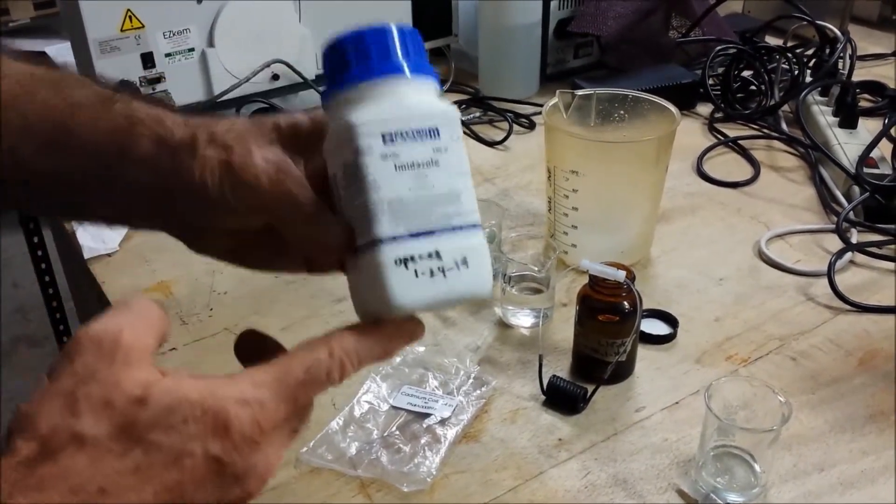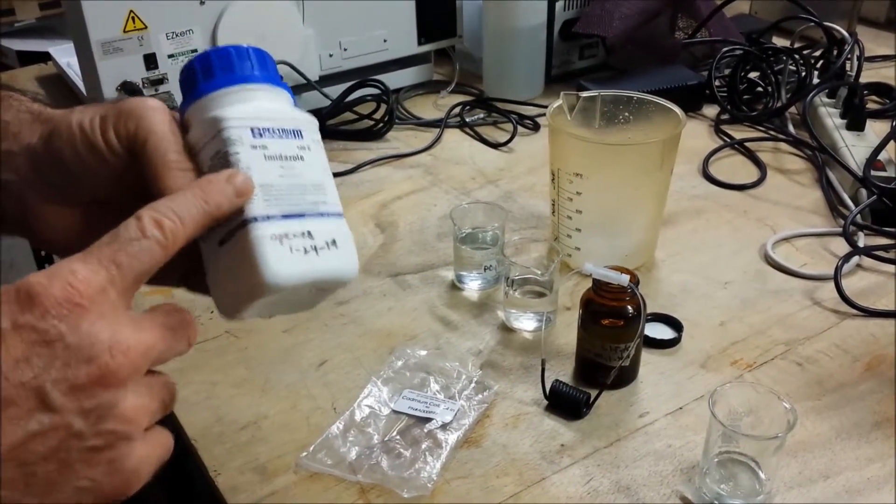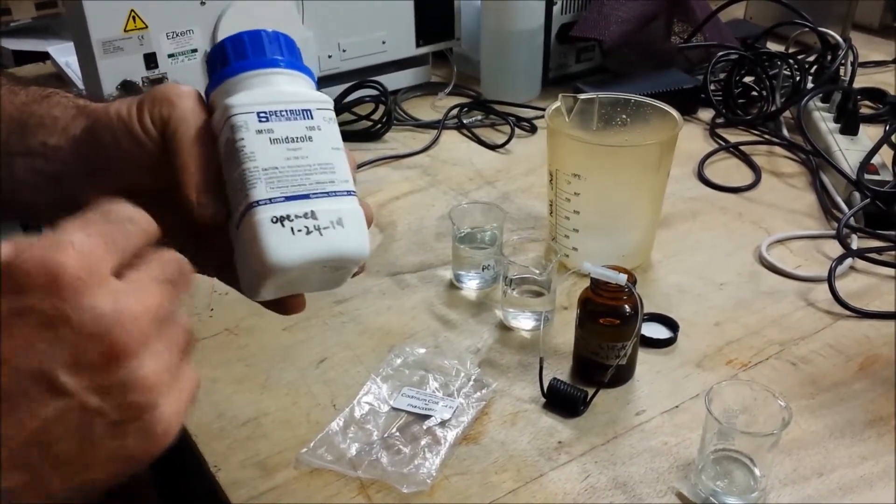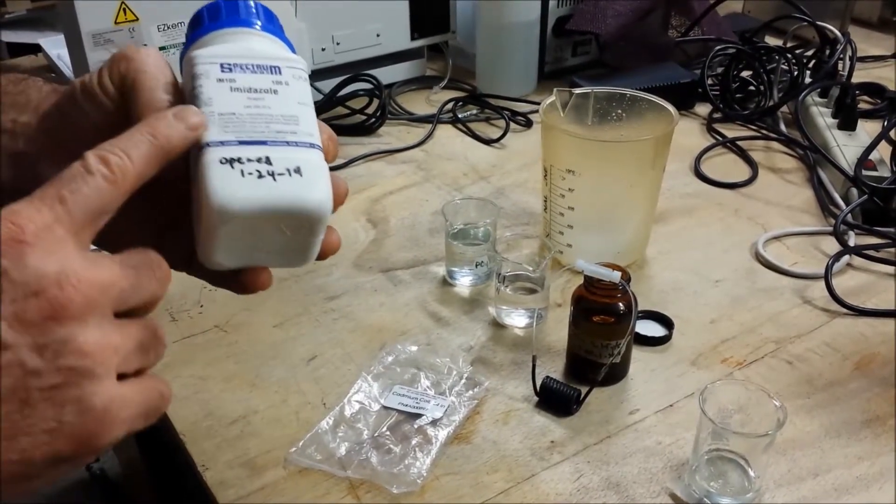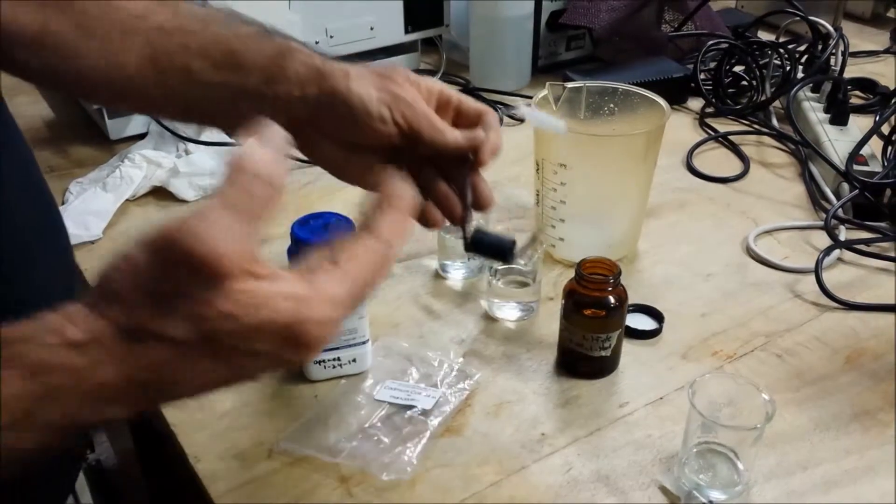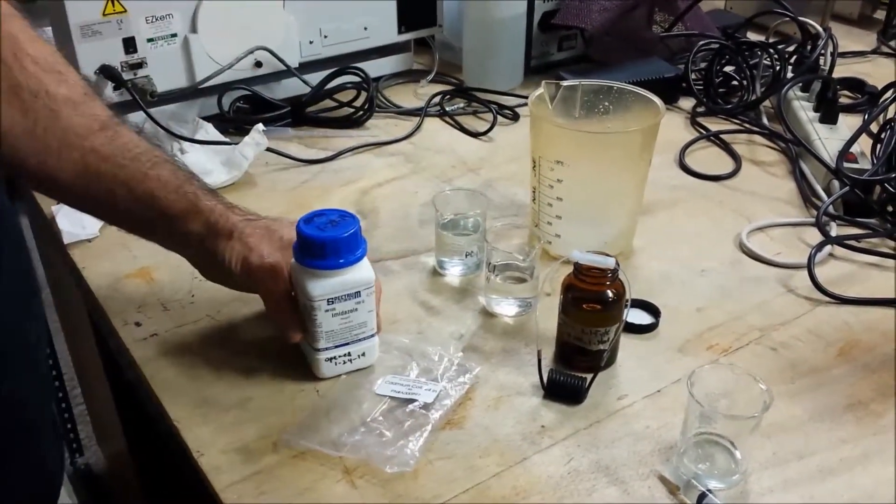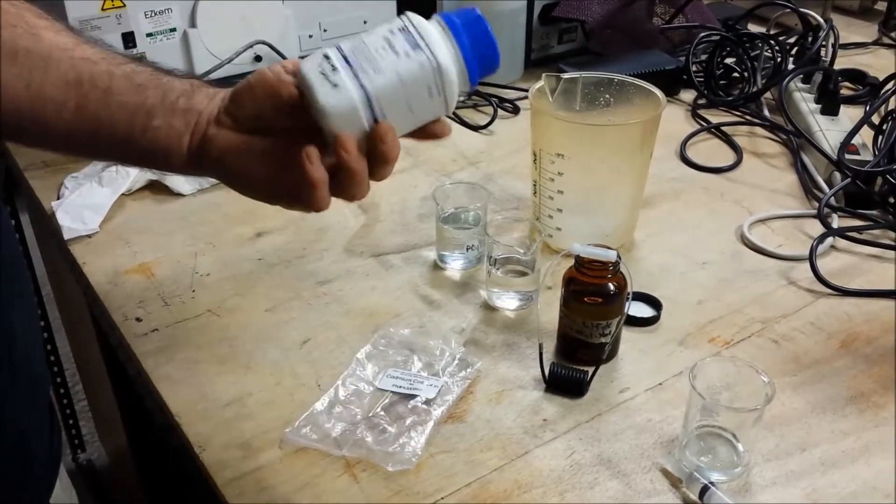One is using imidazole as the buffer instead of ammonium chloride. This is an approved replacement by the EPA for the buffer. It's a much better buffer because it has no chloride. Chloride can actually attack the cadmium and cause it to plaque up, and then the copper won't be able to stick to it.